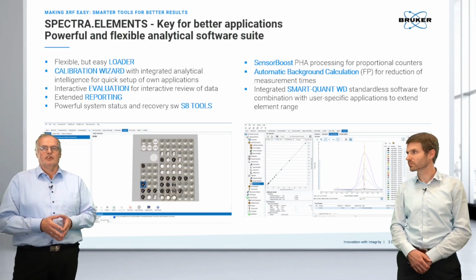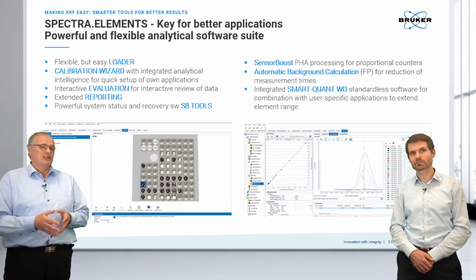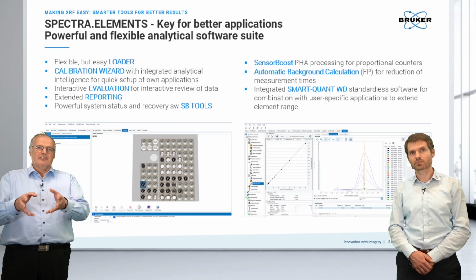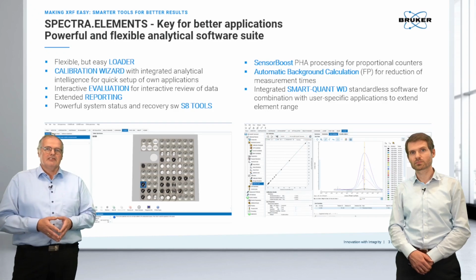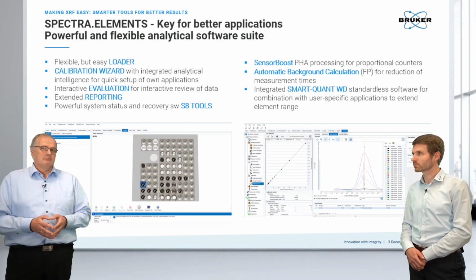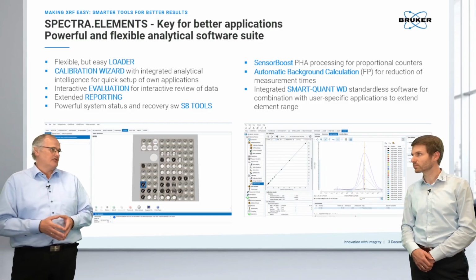We came up with automatic theoretical background calculations, which especially helps reduce measurement times. And putting all this together and providing those tools also within the standardless software helps you in a lot of cases where you don't have any routine application available.